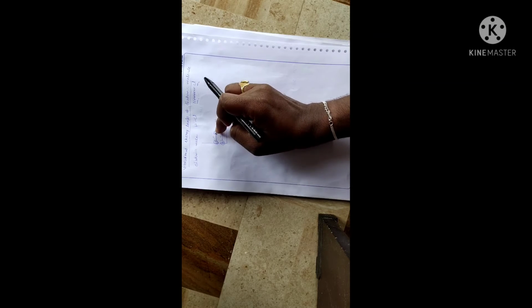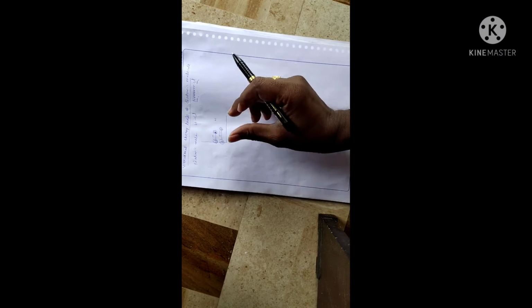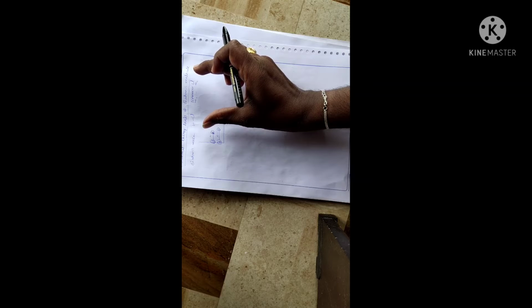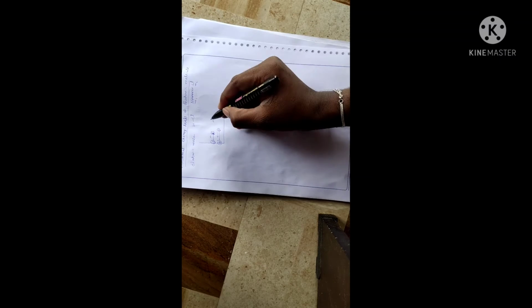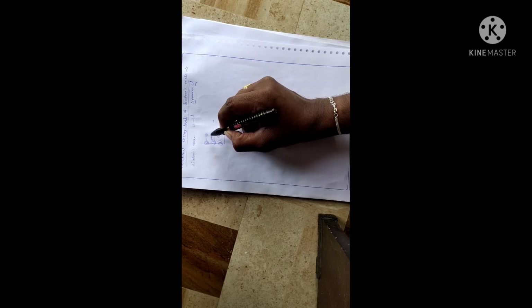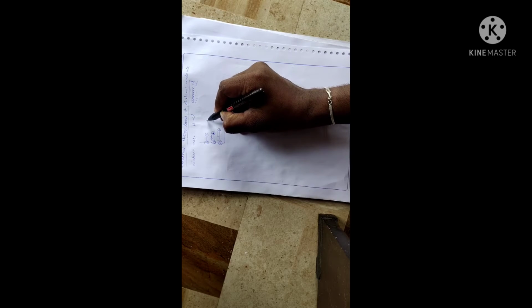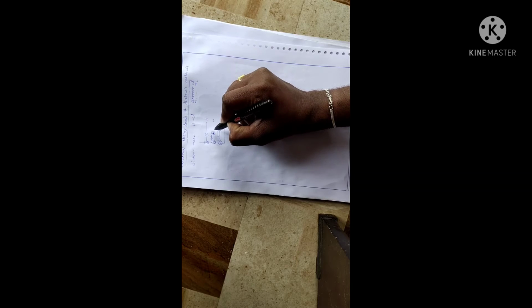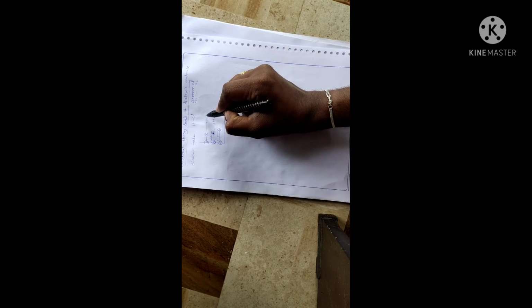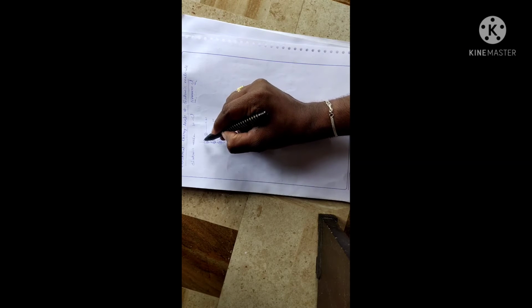Again we compress the bond length, and due to the development of the restoring force it goes outside with the same force.